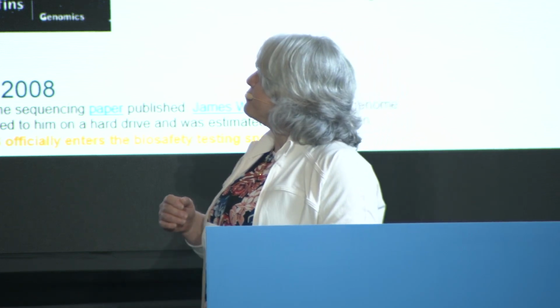I am from a contract research organization, and I'm going to be talking about good manufacturing practices with the little c, current good manufacturing practices. It not only applies to manufacturing, but it also applies to those of us who are in the service industry. We have to find very creative ways to make things GMP when we're working with vendors who like to have research use only or RUO instruments in the world.